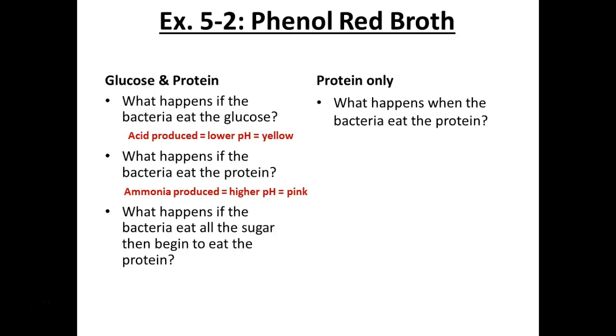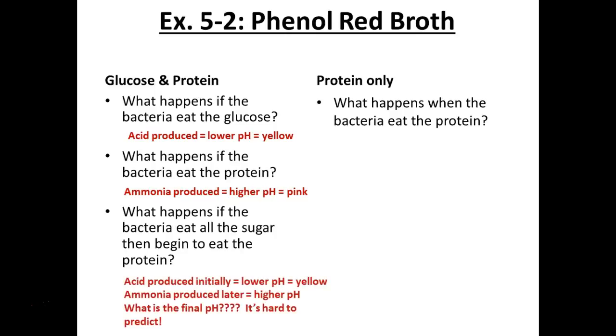And then if you let it keep going, you get those tubes that I gave you guys earlier, and it turned pink. But how did you know, other than the fact that I told you that it ate up all the sugar first, what else did you see in that tube? You saw the gas bubble, right? So that gas bubble would be a clue that maybe it ate the sugar first, right? So for some of you guys, that's why we re-incubated them.